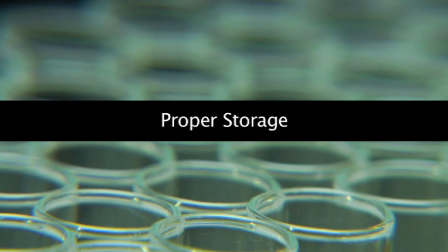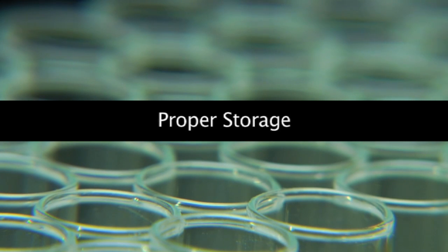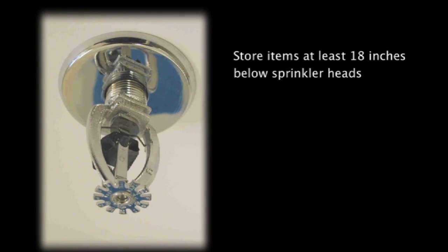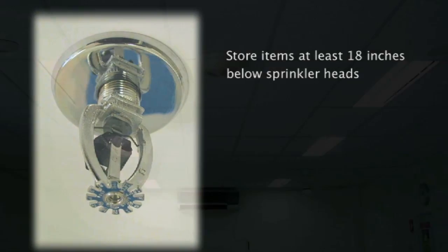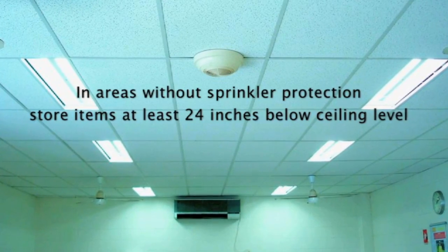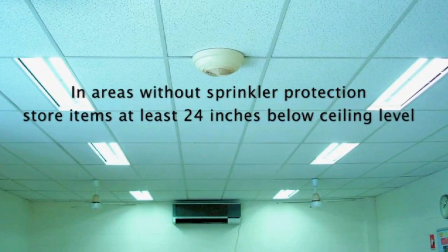Care must be taken when storing even non-chemical items. In areas with sprinkler protection, store items at least 18 inches below the level of the fire sprinkler heads. In those areas without sprinkler protection, store items at least 24 inches below the level of the ceiling.